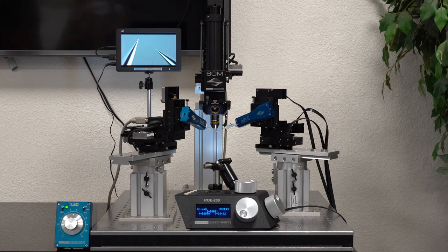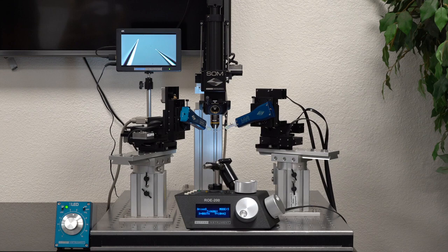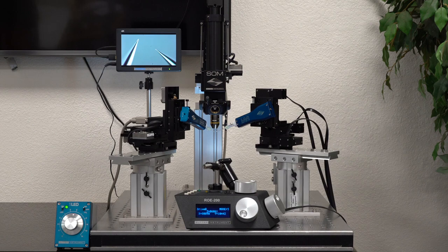The SOM includes a two-position filter cube of our own design which accepts filters in the most common size available from Semrock and Chroma. The filter cube position can easily be changed even during electrophysiological recordings because there is no detent to cause vibration.